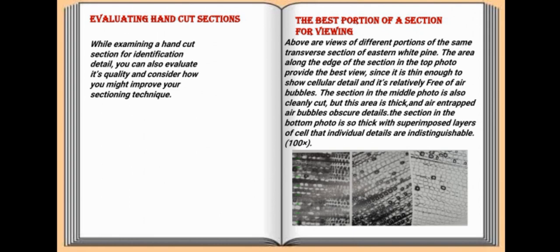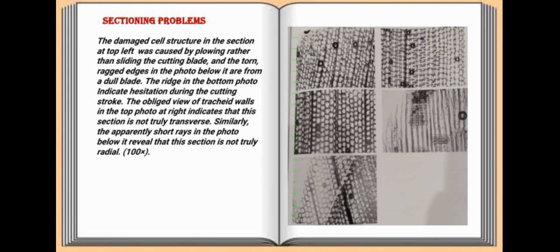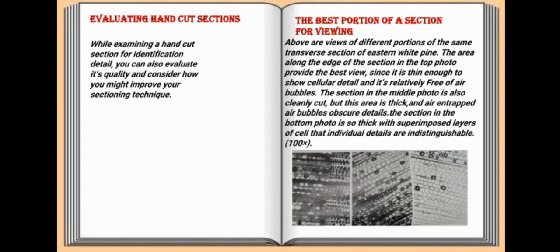The next is the best portion of a section for viewing.